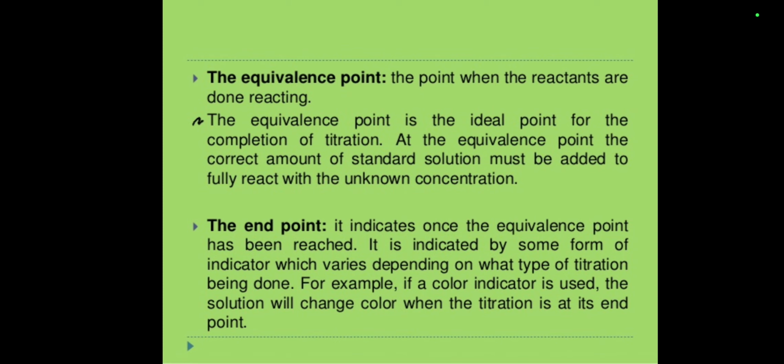Now let's go to the equivalence point and the end point. There is a big difference between the two. The equivalence point is the point when the reactants are done reacting. The equivalence point is an ideal point for the completion of titration. At the equivalence point, the correct amount of the standard solution must be added to fully react with the unknown concentration.